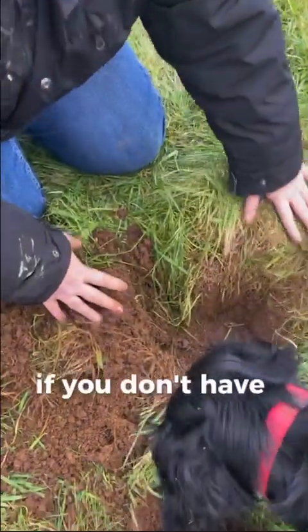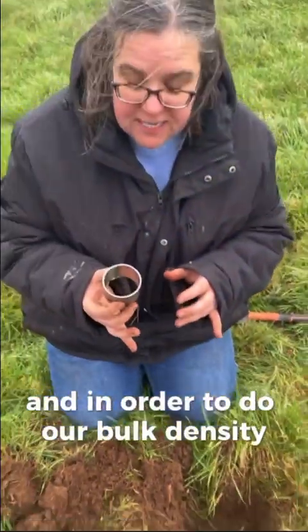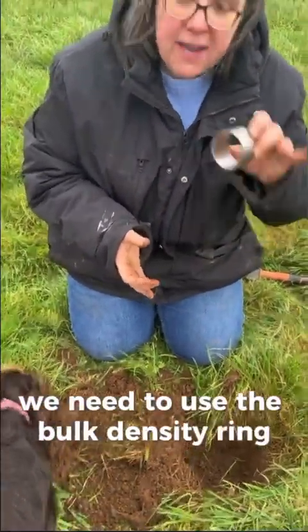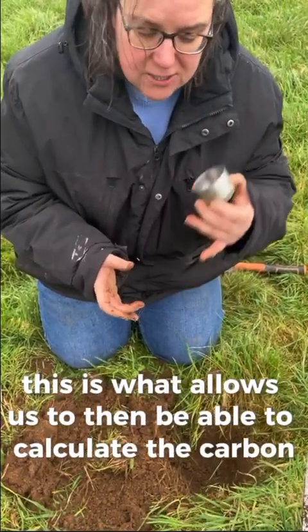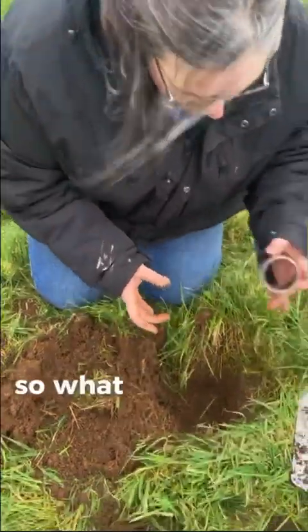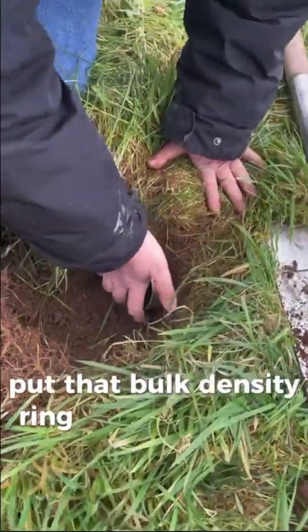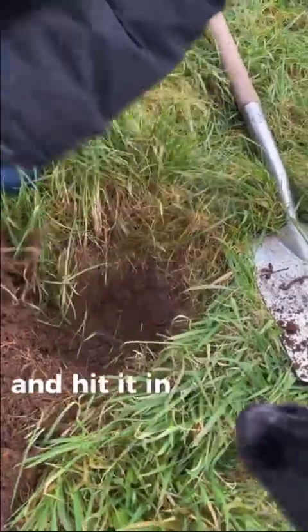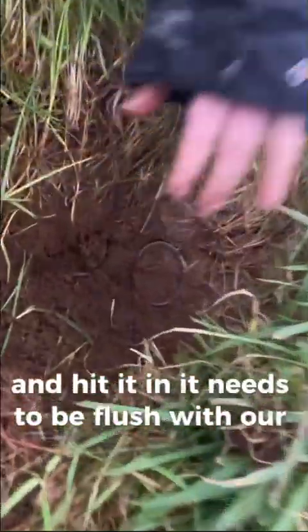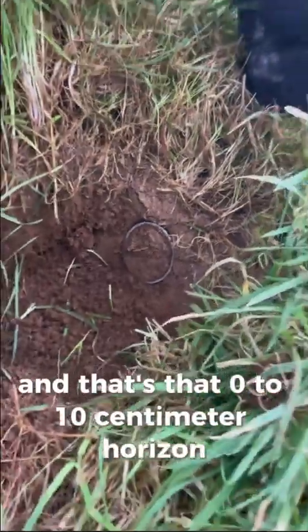If you don't have time to do that, don't worry, but the one that's really important is our bulk density. And in order to do our bulk density, we need to use the bulk density ring. This is what allows us to then be able to calculate the carbon stock within our soil. So what we need to do when we've done our soil profile is put that bulk density ring into the side of our soil profile and hit it in. It needs to be flush with our soil. So we can see that I've hit that right in. That's that 0 to 10 centimetre horizon.